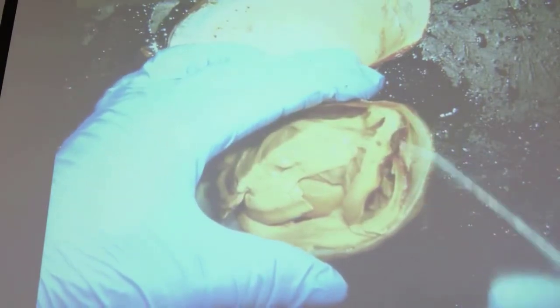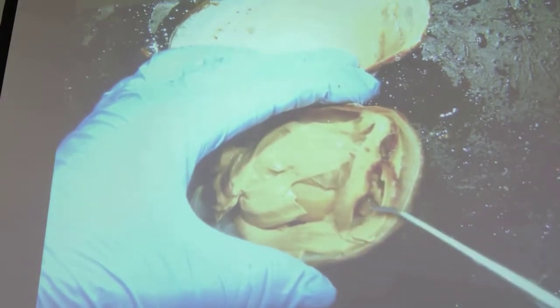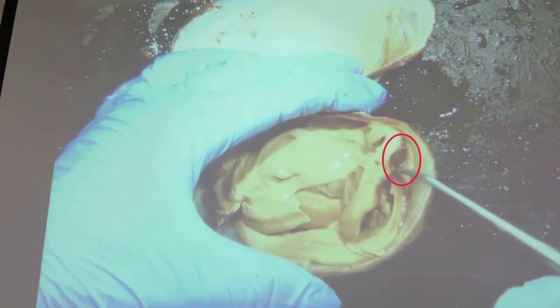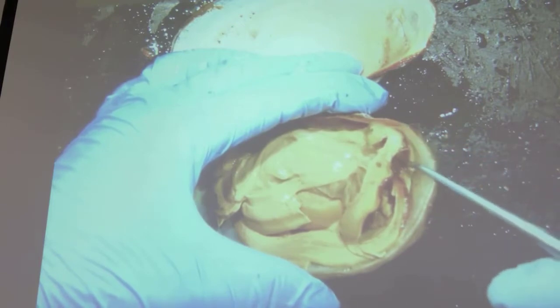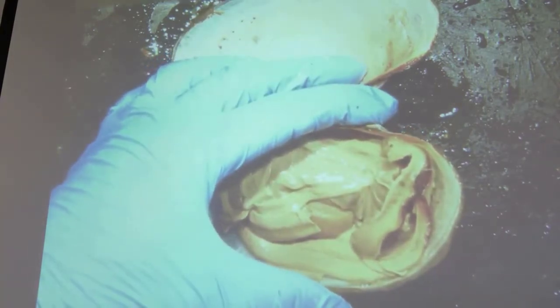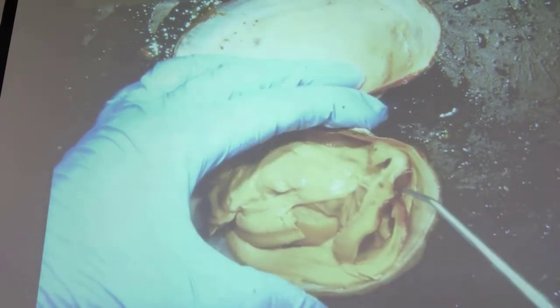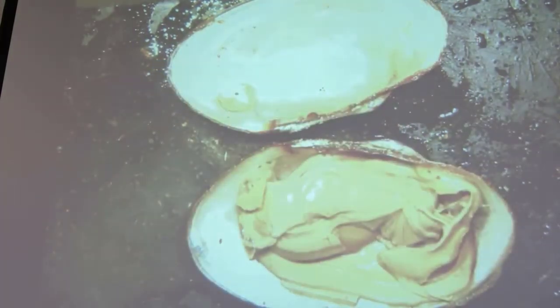So again, here, this is the posterior end of the clam. On the ventral side, we have the incurrent siphon, and right here is the excurrent siphon, which lies dorsal to the incurrent siphon. Water would enter in through the incurrent siphon, hopefully bring with it some food since these are filter feeders. Then as water circulates through the animal, it will exit the excurrent siphon, as well as any feces or nitrogenous waste.